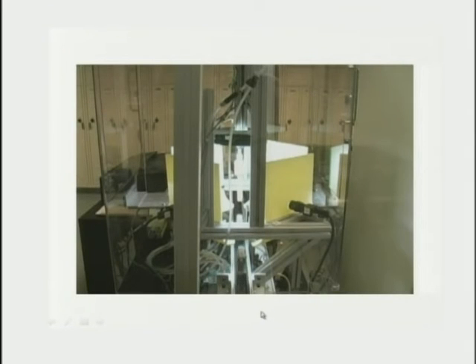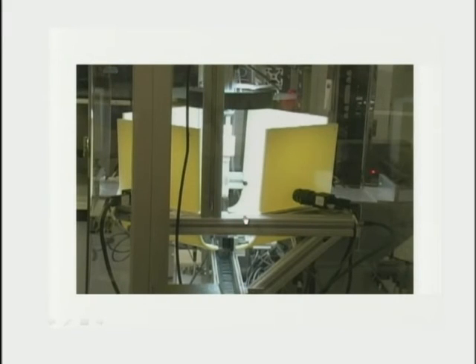Here you see specimens coming down our conveyor system. Here's one of the cameras. Here's one of the cameras here. The other two cameras are around behind these other two panels. And the robot picks the specimen up momentarily in front of the four cameras, and we take four photographs. And then the software assembles the four photographs into a single photograph.